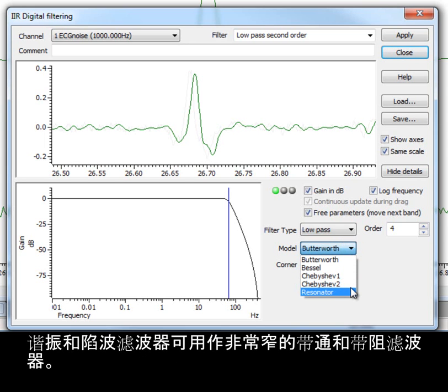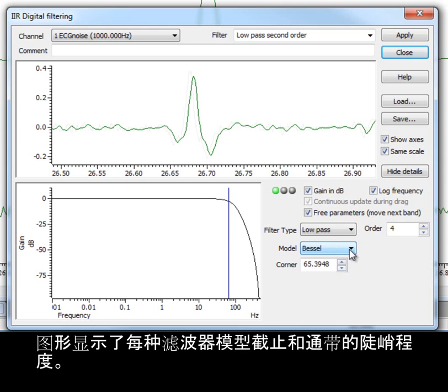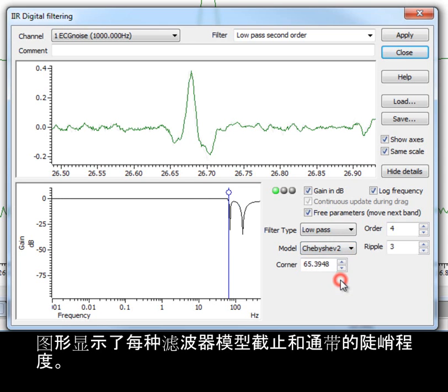Resonator and notch filters can be used as very narrow band pass and band stop filters. The graphical display shows the changes in the steepness of the cutoff and the passband for each filter model.